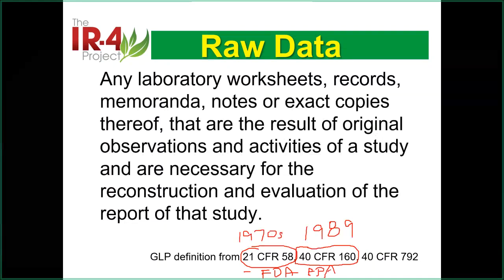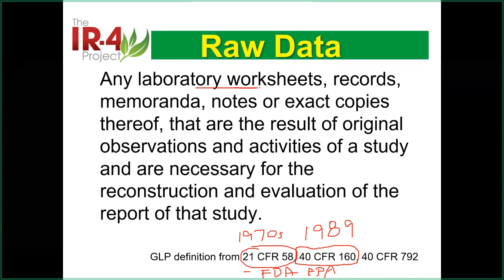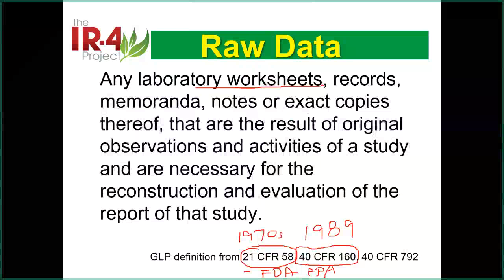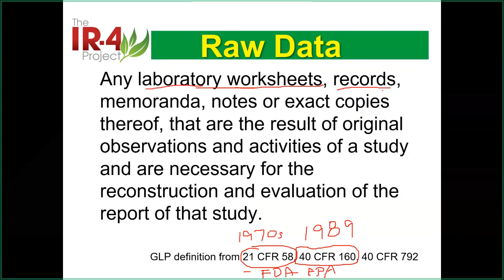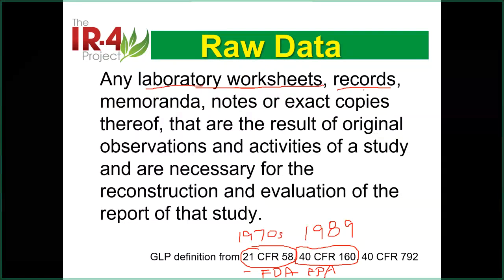Okay, so the wording is the same. Let's read the wording. Well, that time it says any lab worksheet. So you work on something, you write on something. Nowadays, you can also extend it into electronic sheets and electronic data, as long as it's any laboratory-related worksheet, and all the records. The paper records are what they meant that time, but you can say electronic records are also included this time, because right now everything is typed in the computer. In older days, everything was written on paper.